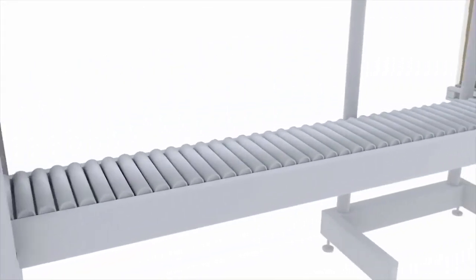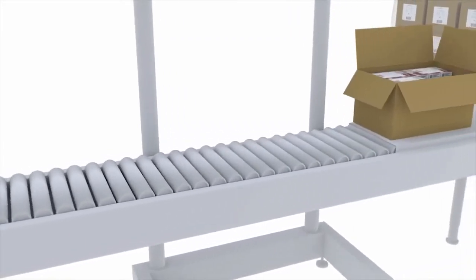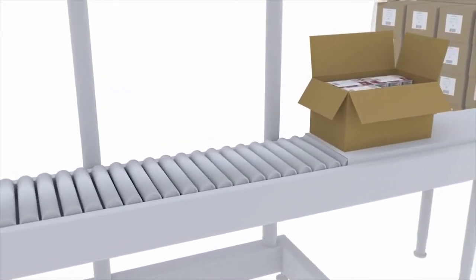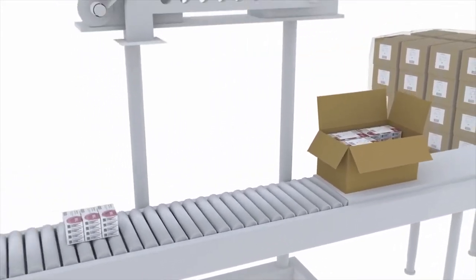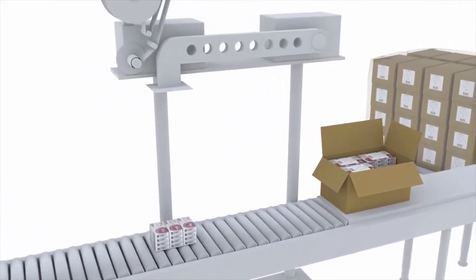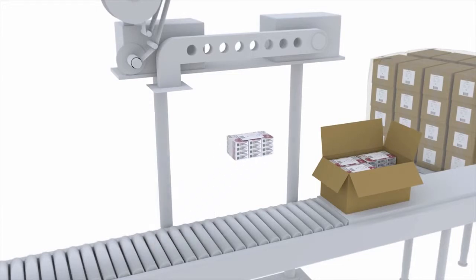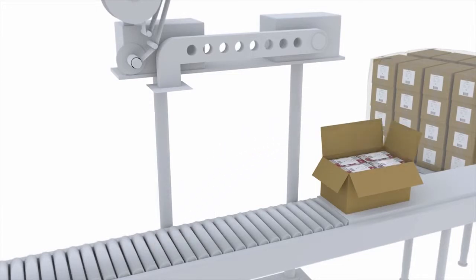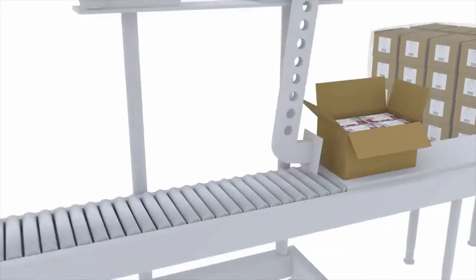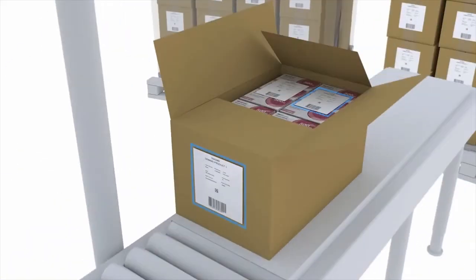Packs can be bundled before being packed into a case. SerialTrack assigns a unique identity to the case and information regarding the case and its contents is compressed and stored in the system. The first level of aggregation is complete.